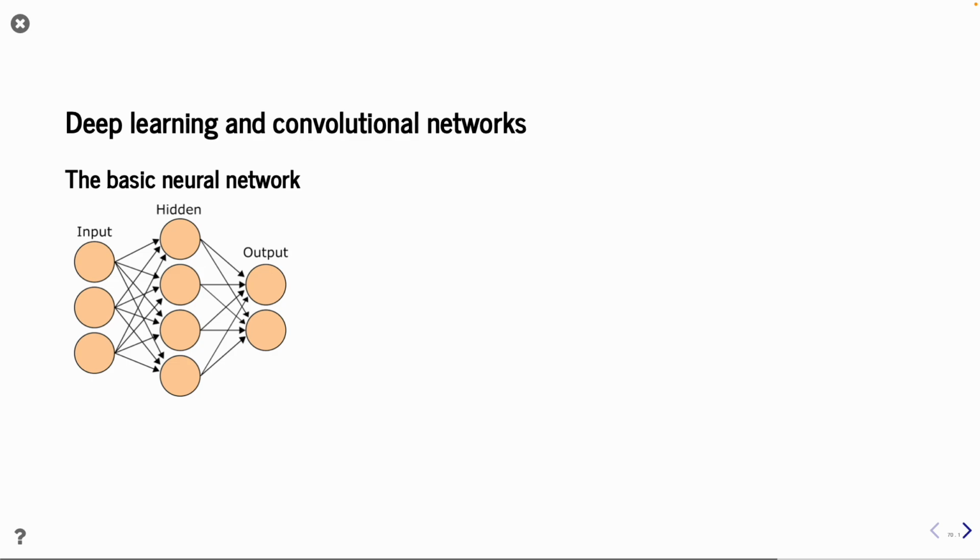And this is, again, a supervised method. So in the beginning, you need to have some training input data and some ground truth that you compare to each other. That is then backpropagated with the help of an optimization algorithm that optimizes all these weights in the network in order to bring a realistic result.